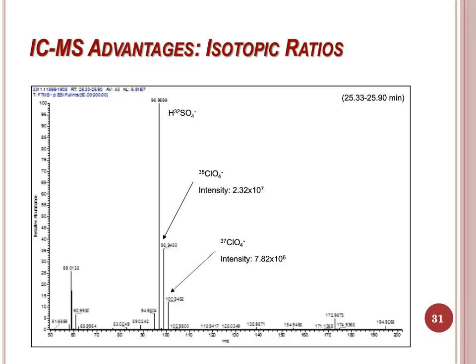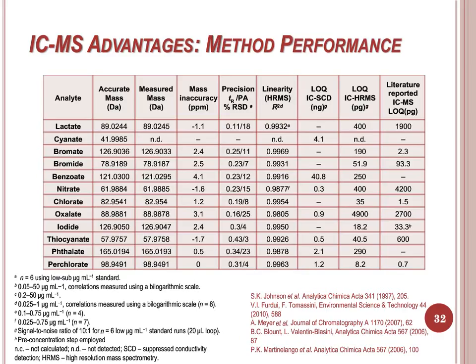The advantage to using mass spec detection as opposed to conductivity is the increase in sensitivity, with absolute sensitivities improving between 7 to 163-fold when using MS detection for this particular method. Absolute LOQs using solvent-enhanced IC-HRMS range between 8.2 picograms to 4.9 nanograms, calculated using a signal-to-noise ratio of 10 to 1, and a lowest concentration range peak error variance limit of less than 20% RSD. Whilst this was a rather conservative definition of LOQ, it was comparable to the other published IC-MS methods shown here.